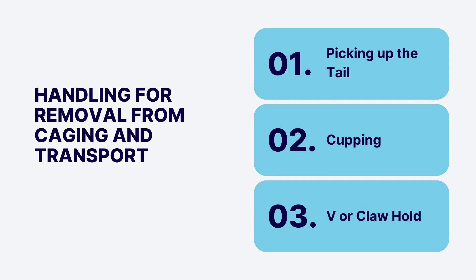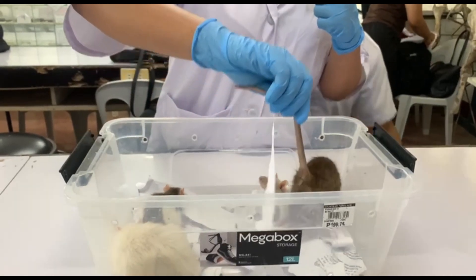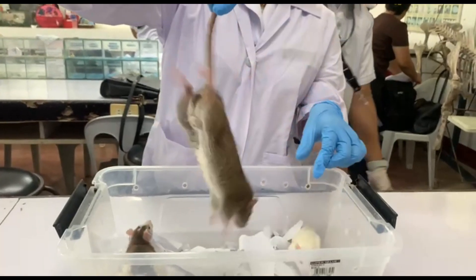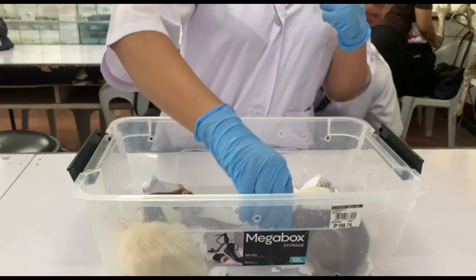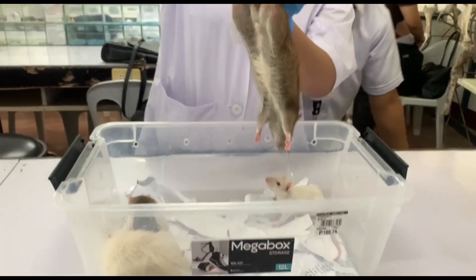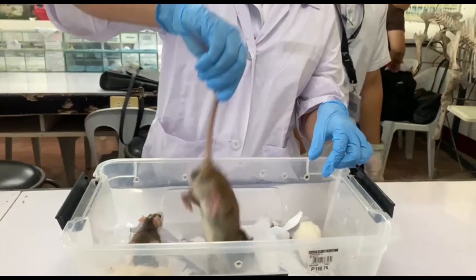Here are the proper handling and restraining techniques performed during the laboratory activity. First is the picking of the tail. This is commonly used in transferring one mouse a short distance, requiring less than 2 to 3 seconds to complete. First, grip the mouse by the base of its tail, lift it up, and carry it to the new destination. Note that you should not use this technique on obese or pregnant mice.